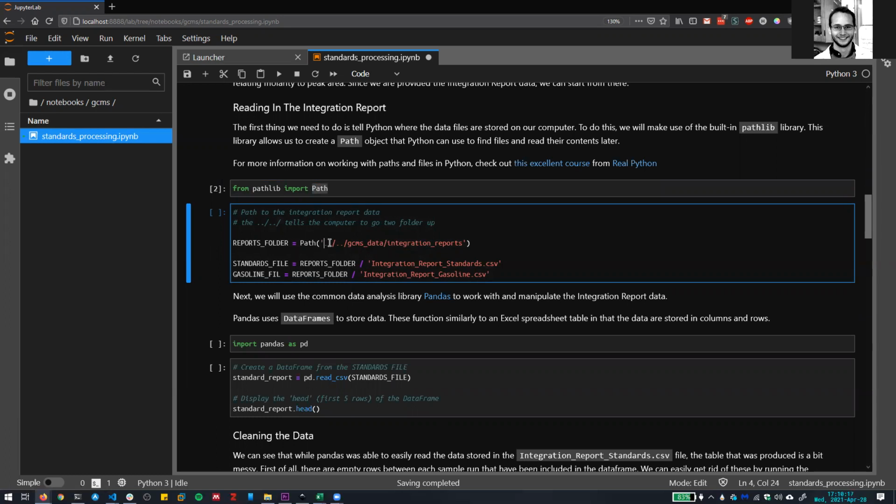So a quick show of thumbs up. Has anybody seen the shorthand here for representing file structures or relative paths using code like this? Anyone know what that means?